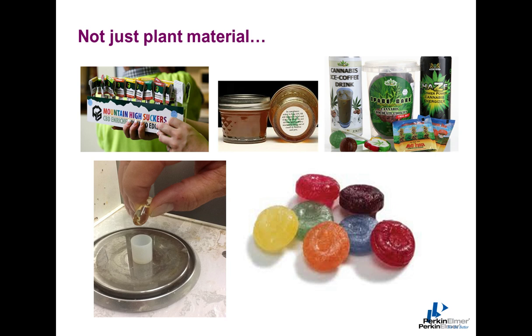And where the challenges can present themselves is making sure you are able to characterize all of the heavy metals in the sample. And we know a number of samples can be very diverse. Hard candies present a unique digestion challenge. High-fat oils, topicals, edibles also present a challenge. But we've been able to work with laboratories to identify the differences and produce methods that can successfully digest each of these samples.